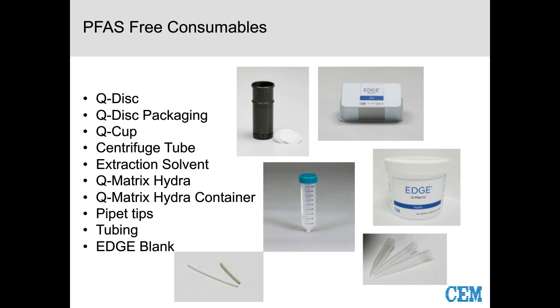You're probably wondering, what is Q-matrix hydra? I will get into that a little bit later on, but we did use it in one of our sample preps, so we needed to test it. So we tested our Q-matrix hydra and the container that the Q-matrix hydra comes in, the pipette tips that we used for spiking, the tubing, both the polypropylene and the PEEK that we used, and then we also tested an EDGE blank. So anybody in this industry is going to take a lot of care to make sure that we are not introducing any PFAS into the system during the extraction.